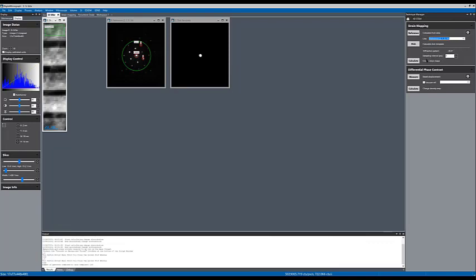So you might want to do a sampling interval to, for example, skip every 5 pixels or skip every 10 pixels and calculate a quick strain map instead of calculating the full strain map for the full data set on the microscope. So within minutes, you can do a quick calculation, get some answers and decide if, let's say, you want to increase the exposure time, or you want to change the camera length, or you want to move to a different region of the sample. And then once you're happy with that, you can take that and process the full data set offline.